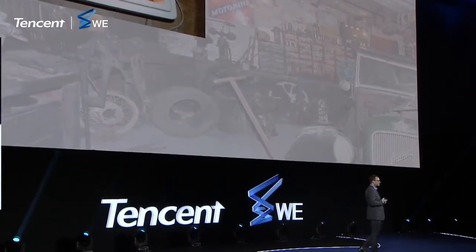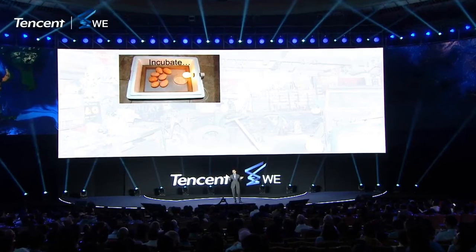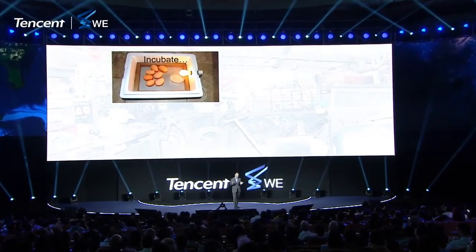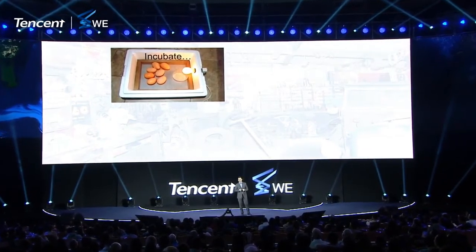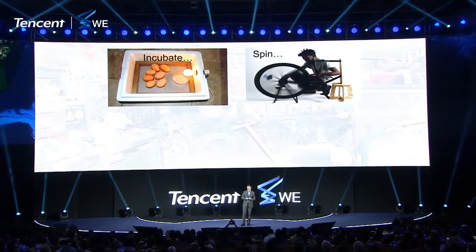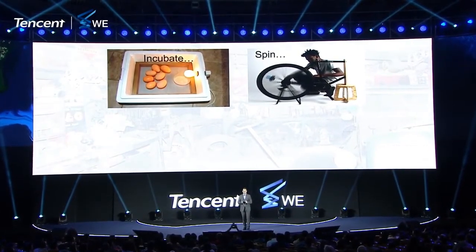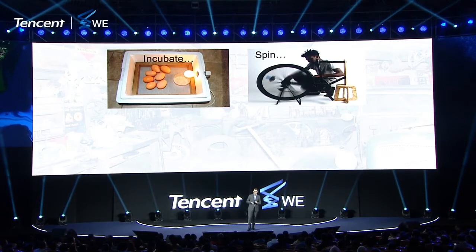I think we can. So this is an incubator, styrofoam box and a light bulb. It will give you a reasonably stable temperature. You can hatch your eggs. This will work. If you want to build a centrifuge, there's so many things out there that spin. You can use a bicycle wheel. You can use a fidget spinner. Many tools spin. Many tools spin fast enough to separate samples in a meaningful way.